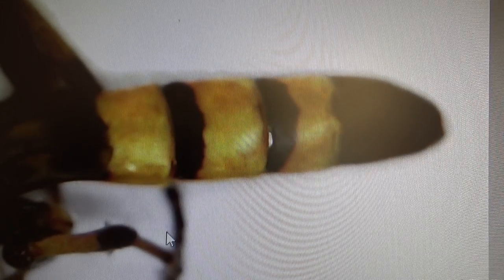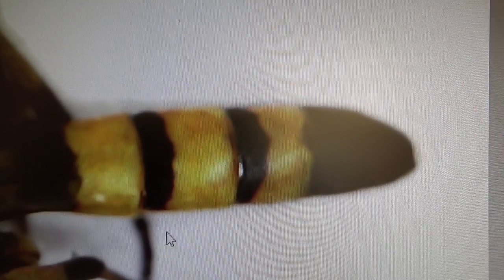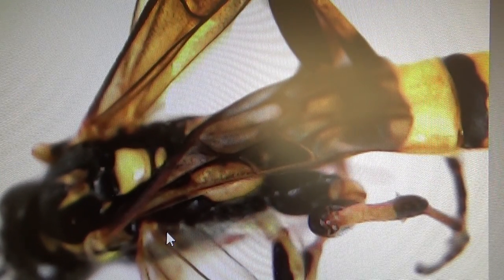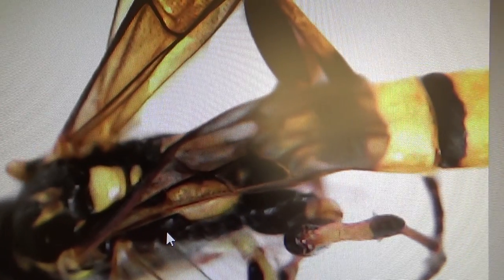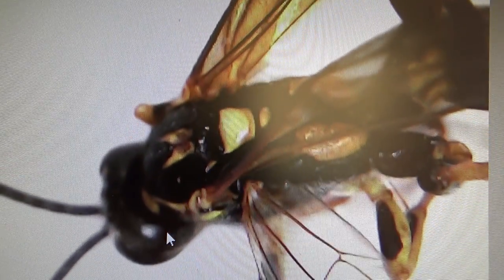I call it a yellow jacket only because it looks like crossing guard colors - the black and the yellow. Look at the beautiful wings. I can see right through the wings and everything. All the details you can see in a bee.